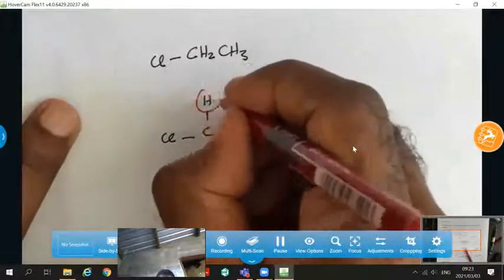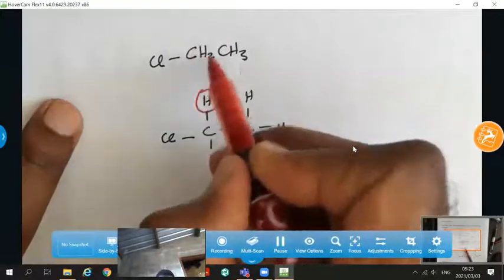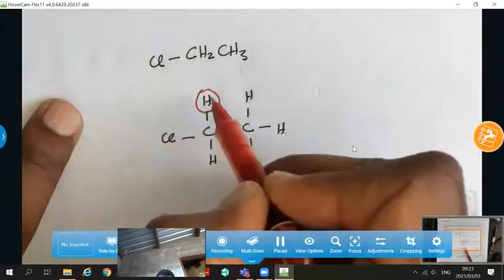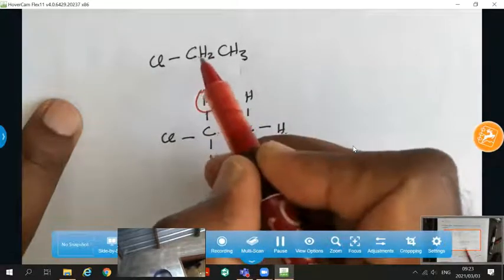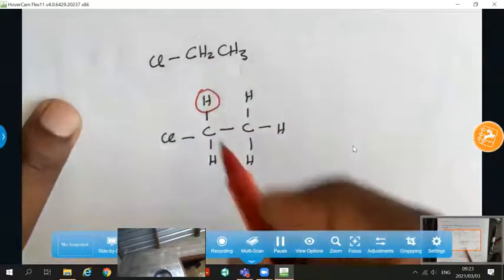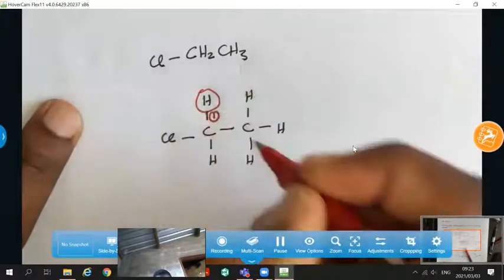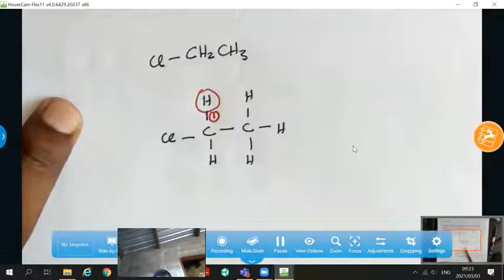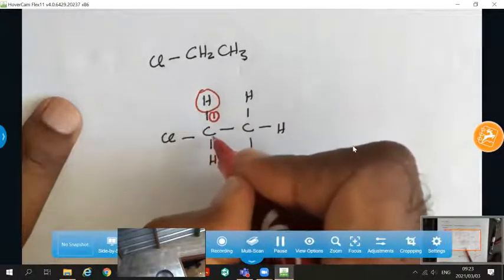So you need to pick a proton and then work out the number of bonds. When I pick this proton here, I'm actually looking at the CH2 group, because that's one of the hydrogens in the CH2 group. And you'll note that the 2 hydrogens on the CH2 group are equivalent. Then I start to go out of the hydrogen. That's my first bond, and the first bond that the hydrogen forms is to the carbon. So that's 1 bond away from that hydrogen atom, and I have a carbon atom.